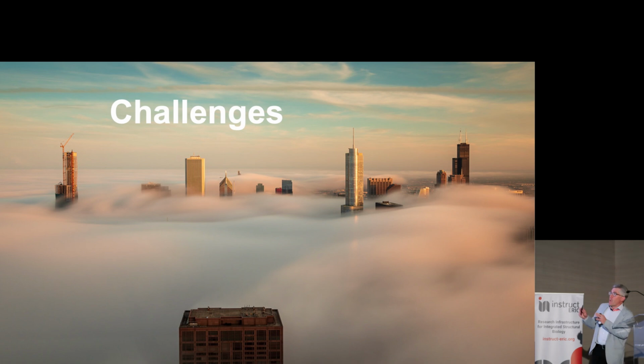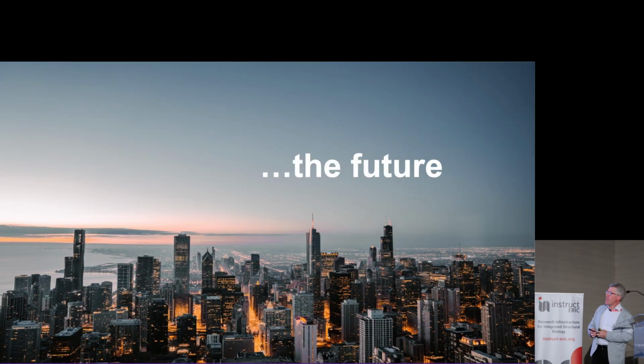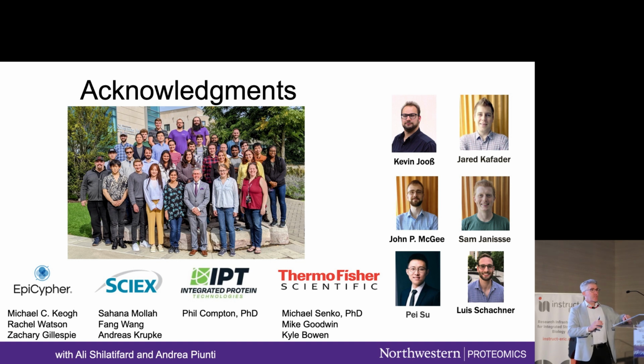And so while I could only give you the very beginnings of proteoform landscapes, a classic one I think about is KRAS. With KRAS, we started off with 11 proteoforms, and now we have 39 proteoforms, and we're assigning function to them slowly. But you can develop technology, deep proteoform sequencing, to really give your perspective about a city like Chicago, or our biology and all the cell types in human beings. I'm happy to describe that project more. There's tons of literature out there about it. But for now, I'll just yield to questions.